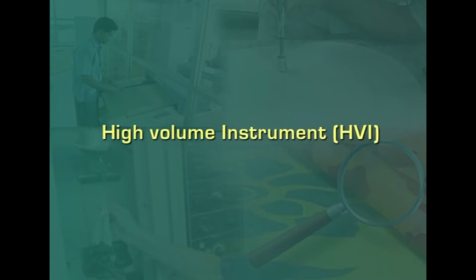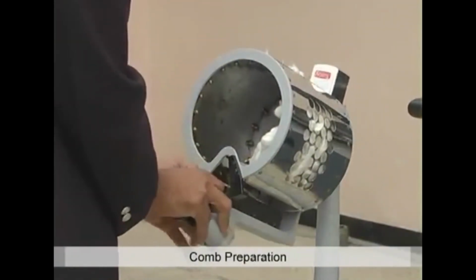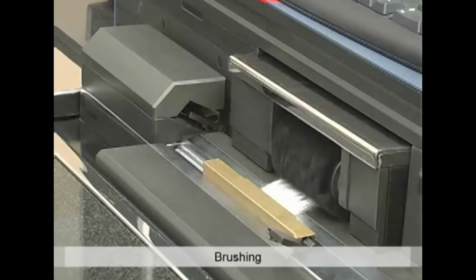Now let us have a look at the high volume instrument. In this instrument, various properties of fibers such as length, strength, fineness, color and trash are measured. In the length measuring unit, the fiber length is measured in a non-aligned fiber specimen form. The preparation of the specimen includes combing to straighten and parallelize the fibers and brushing to remove the fiber crimp.